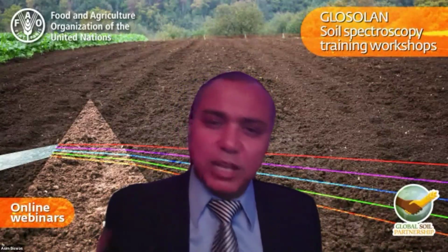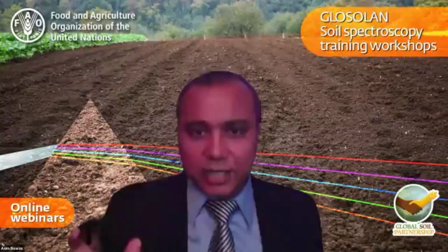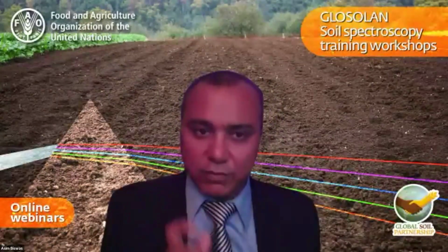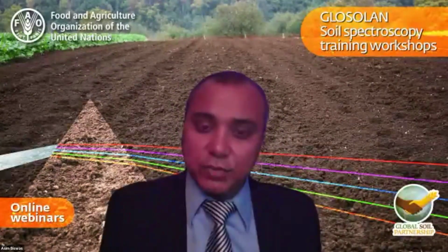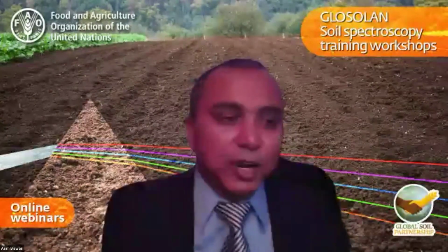I have seen papers where you're combining with something else and there's no connection. This will be one message to everybody when we're using spectroscopy: think about the physical meaning of it. Think about the energy you are shooting into the soil and how that energy is associated to the different fingerprinted materials or different constituents of the soil. If it is not directly a primary relationship you find, then try to develop a secondary or a tertiary relationship, but be cautious about what it can say. So from a farmer's perspective, of course, I want that data set, but for some of those data sets, we have that fundamental limitation.